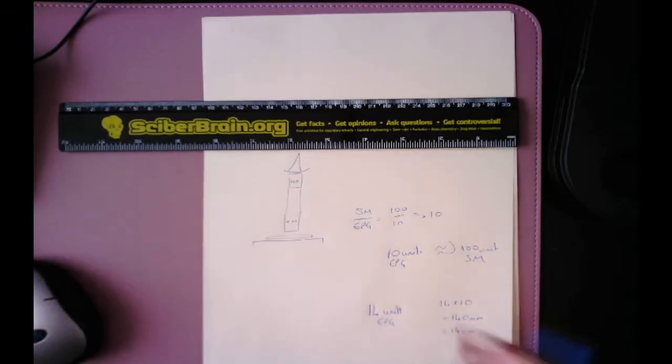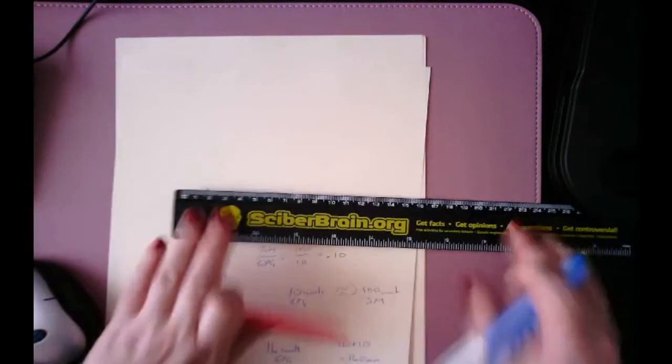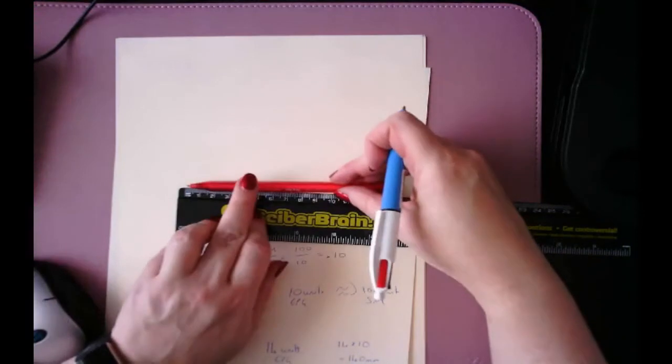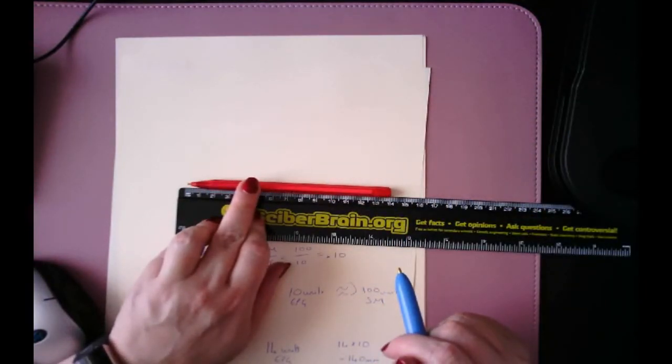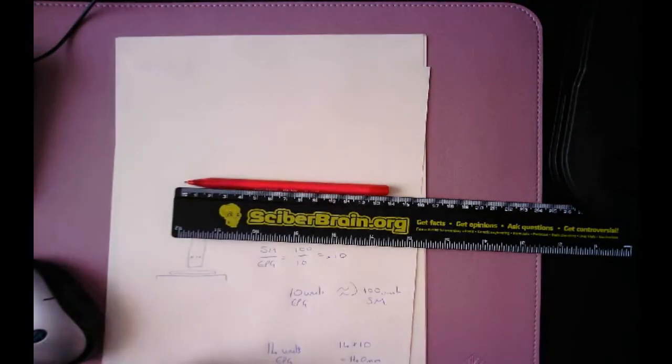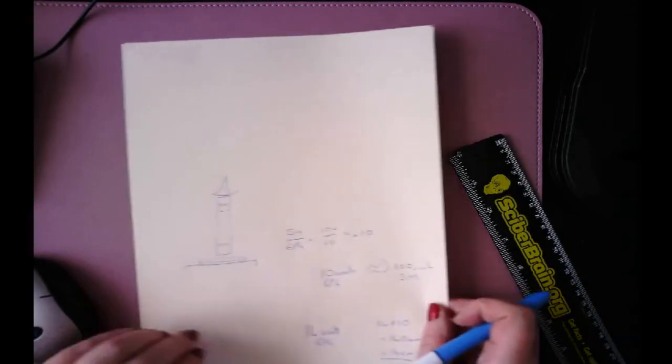If I grab the same pen and stick it down, the pen is just about 14 centimetres, so therefore this has worked. Like I said, we're using this as a way of working out the real size of our object.